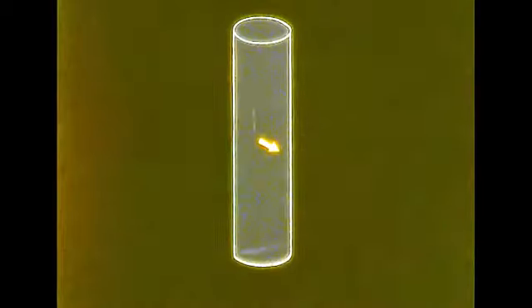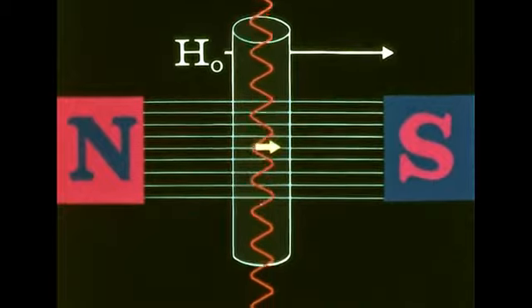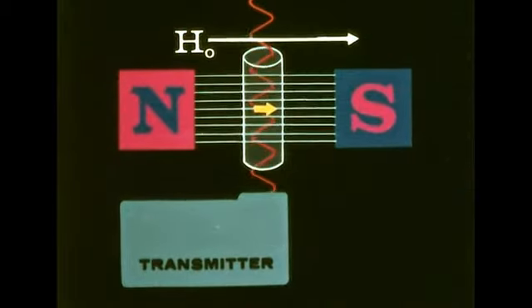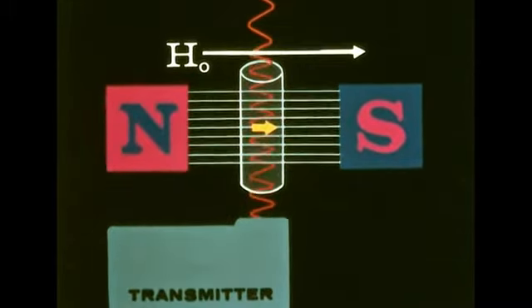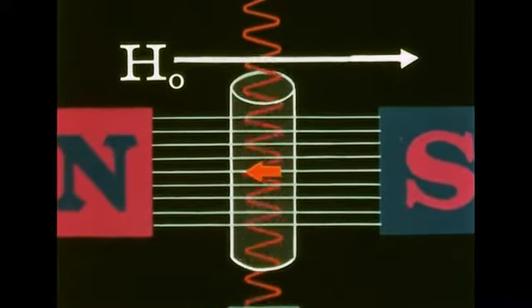How is an NMR experiment carried out? The sample, which must be a liquid or a solution, is placed between the poles of a powerful magnet. A radio signal is applied from a transmitter. If the experiment is done at constant magnetic field, we vary the transmitter frequency. When the energy of the radio frequency equals delta E, some nuclei absorb energy.